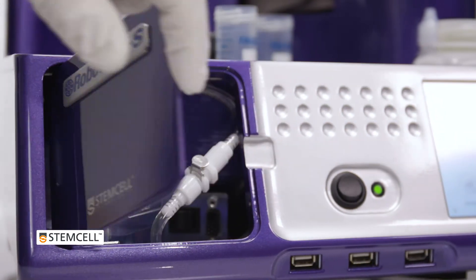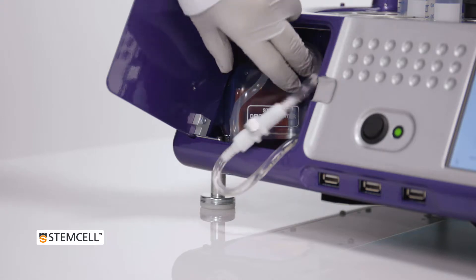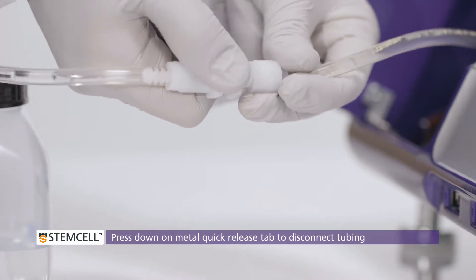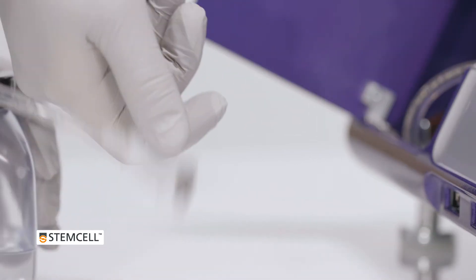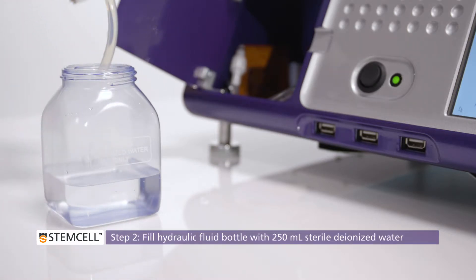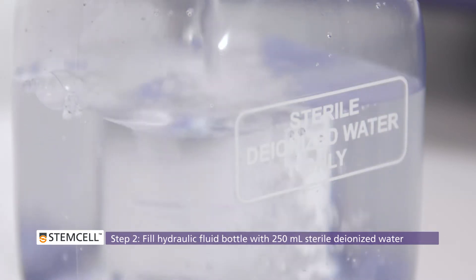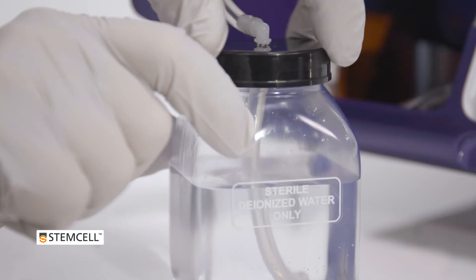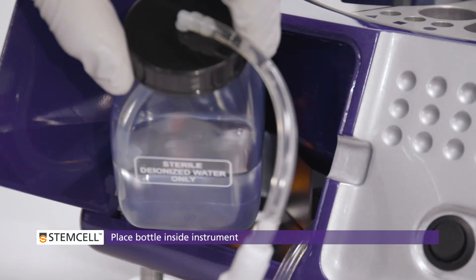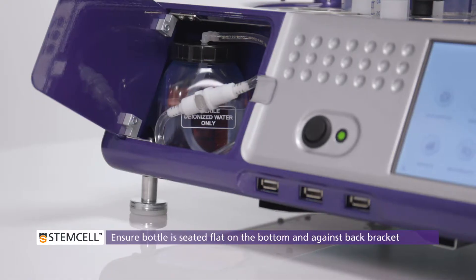To refill the hydraulic fluid bottle, open the panel at the front of the instrument and remove the bottle from inside the RoboSep S. Disconnect the tubing by pressing down on the metal tab on the white quick-release barb. Unscrew the cap and fill the bottle with 250 ml of sterile deionized water. Cap and reconnect the bottle to the hydraulic system tubing and place it back inside the instrument. Make sure that the bottle is sitting correctly inside the slot so the sensor measuring the liquid level can detect it.